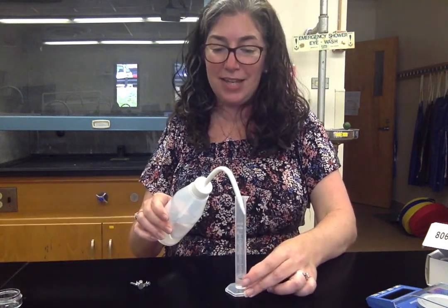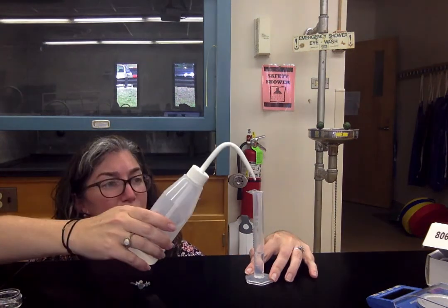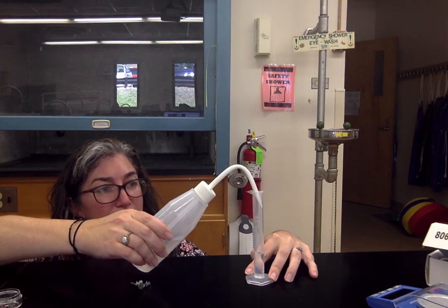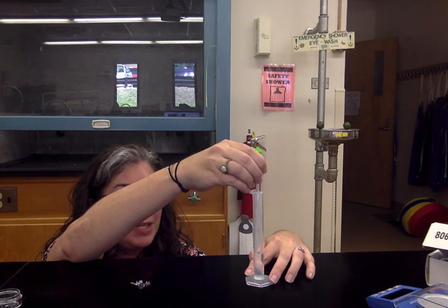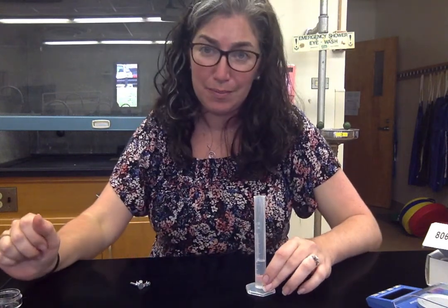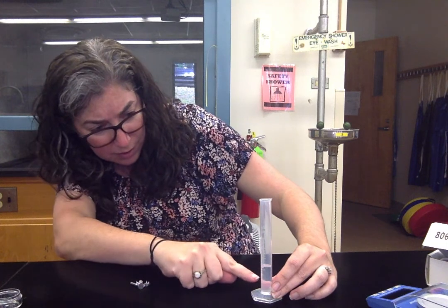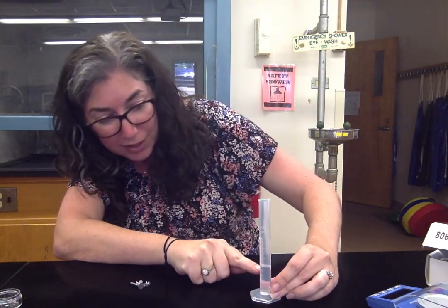Density is mass over volume, so now you need to get the volume. You're going to put exactly five milliliters of water in the graduated cylinder. When reading the graduated cylinder, get down to eye level on a flat surface and read at the meniscus — the bottom of that little curve. I went a little overboard, so I'll use my dropper to remove some so I have exactly five milliliters, which I would record as 5.0 milliliters. The tick marks on here are every 0.2 milliliters, so don't count them as 0.1.